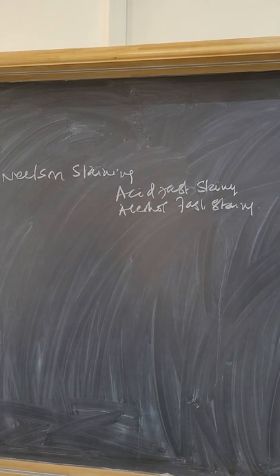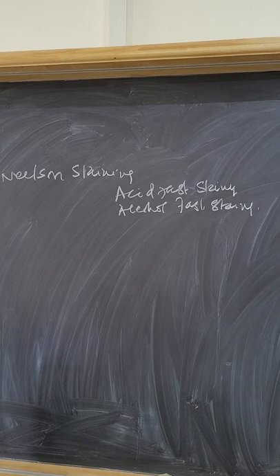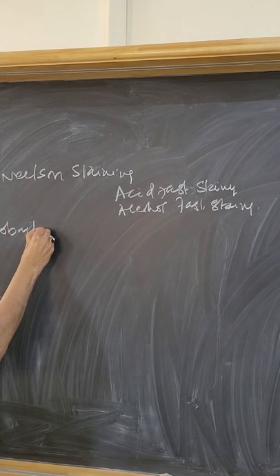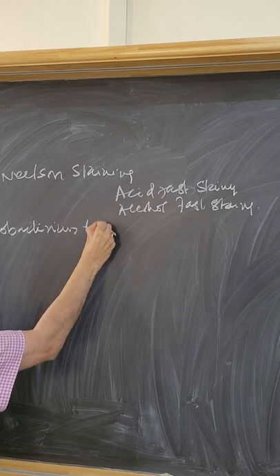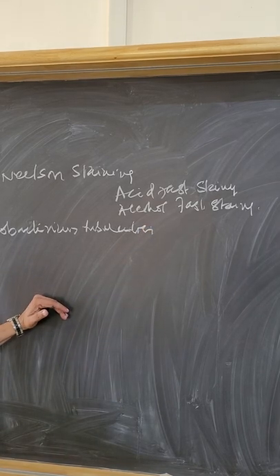It is also called as? Acid fast staining. Alcohol fast staining. Although Mycobacterium tuberculosis.